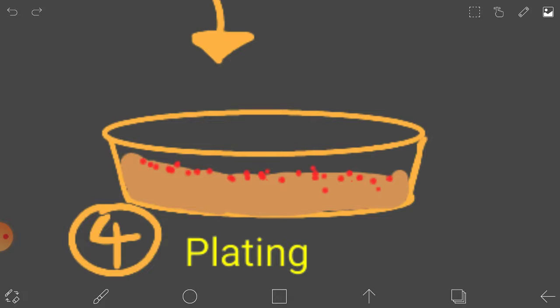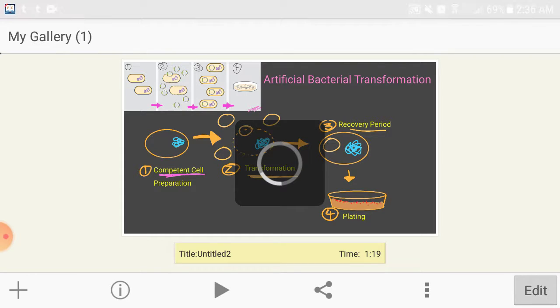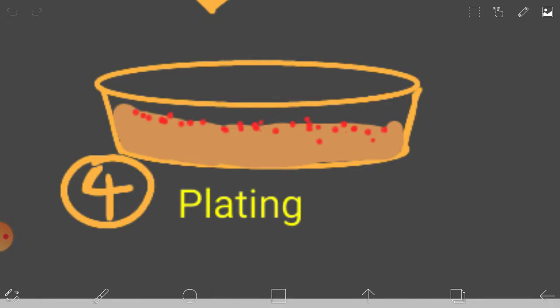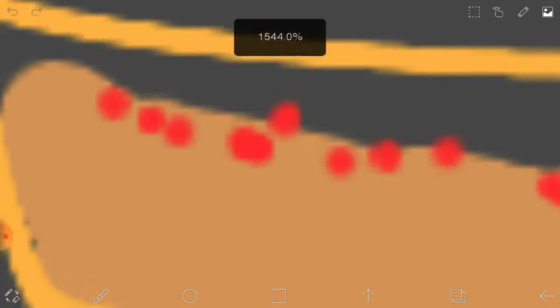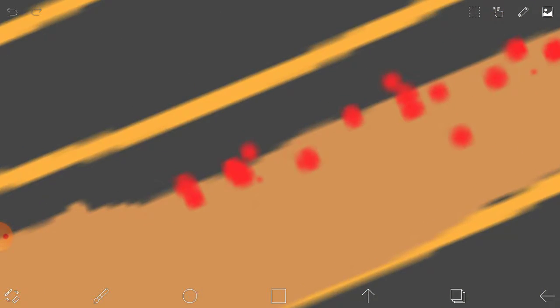The bacteria you tested, we can't usually immediately tell that it has the plasmid, but we can immediately tell if these bacteria have these plasmids whether they die or not, because the bacteria with the plasmids will survive because the plasmids are most likely things that are resistant to antibiotics.